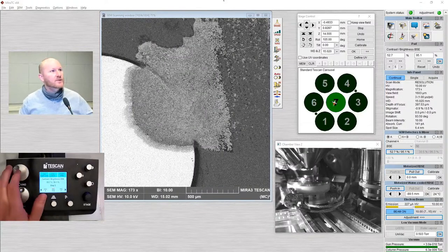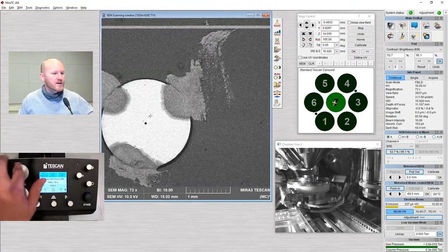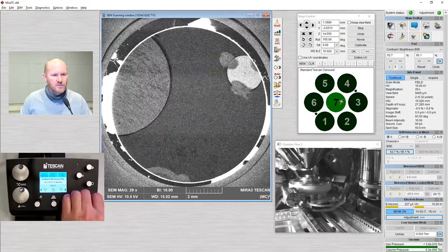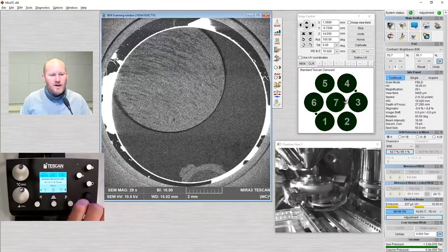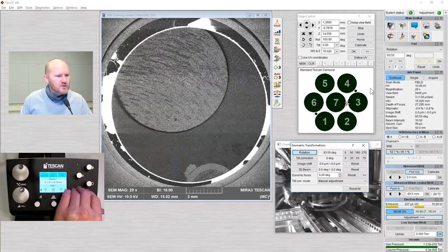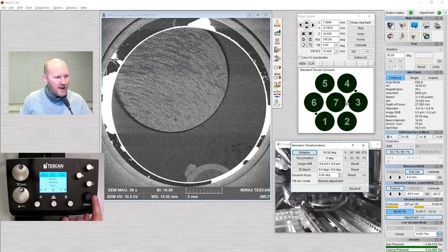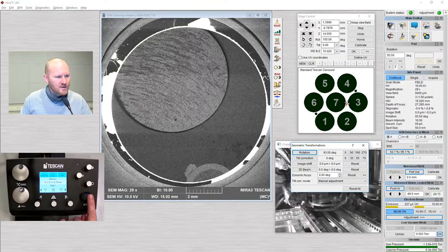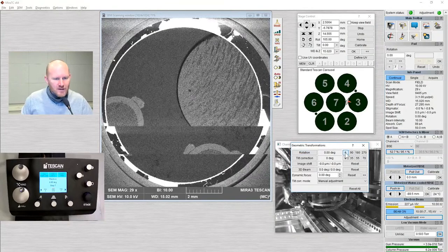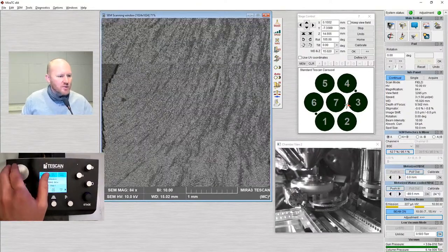I noticed something weird: I was pretty sure when I loaded this sample I put our 10 spheres at 12 o'clock. But as I push the joystick left and right, the image is moving up and down — a previous user left scan rotation on. Unfortunately this is just something we have to deal with: users will configure the microscope for their own use and often just forget to reset it. Let's go back to secondary electron mode.